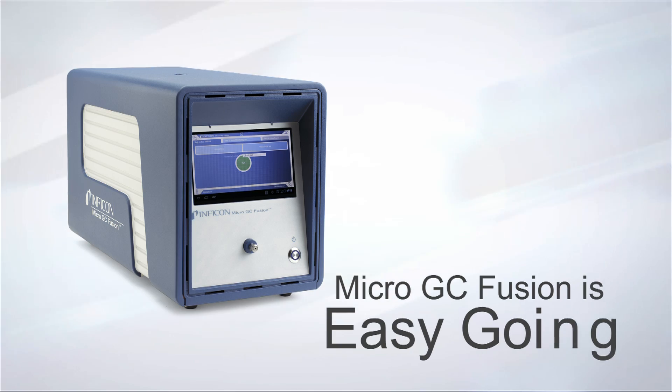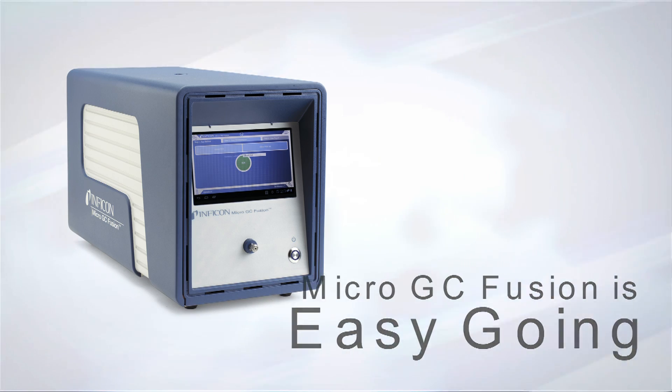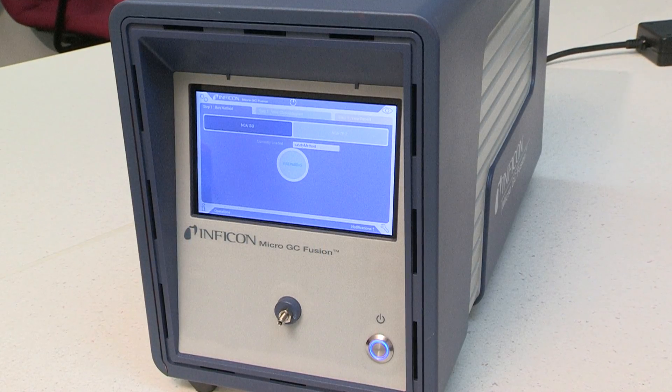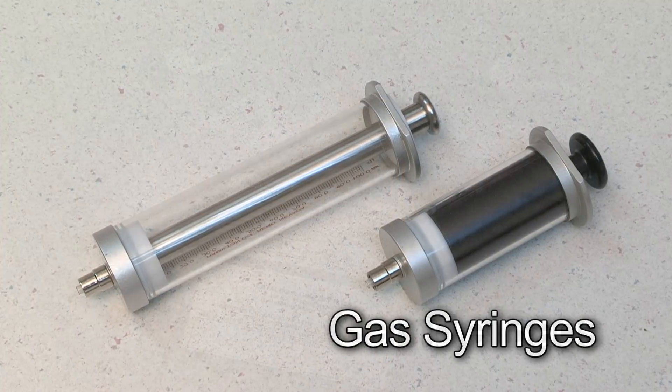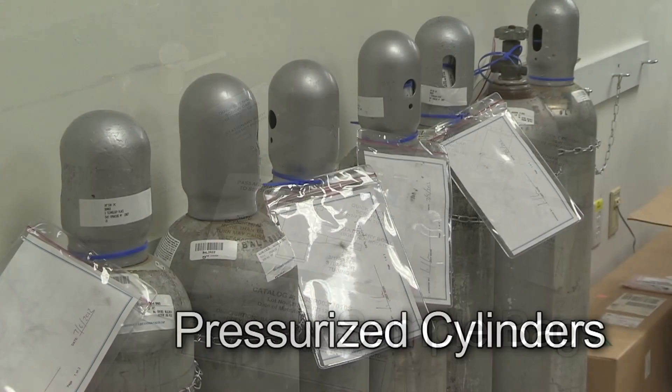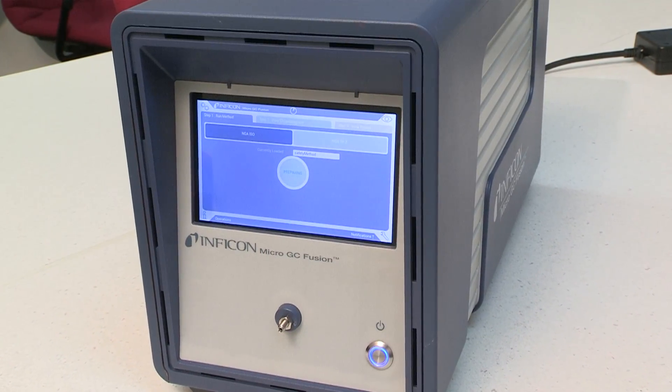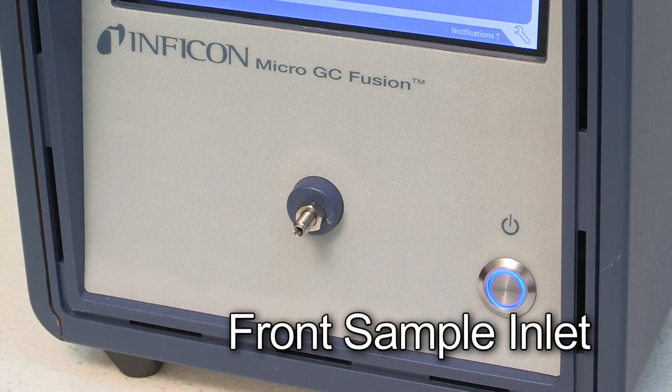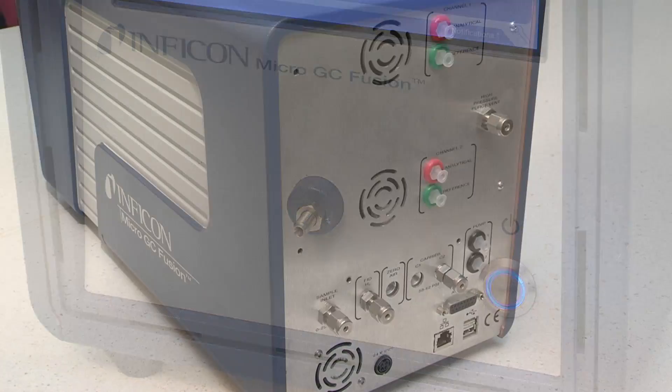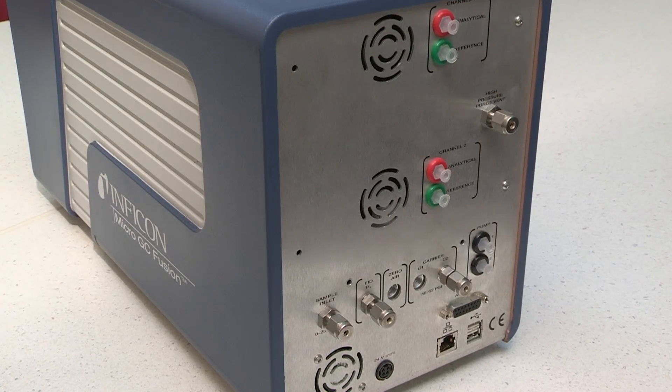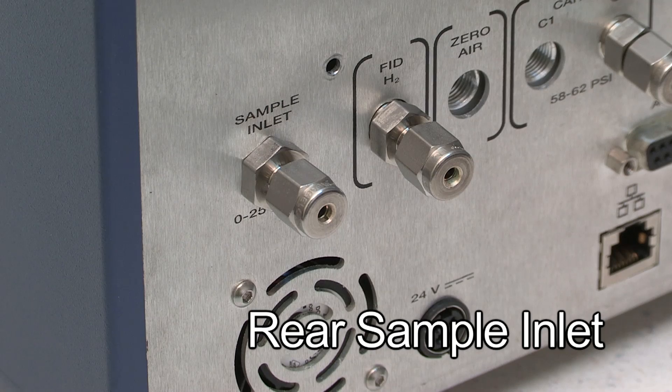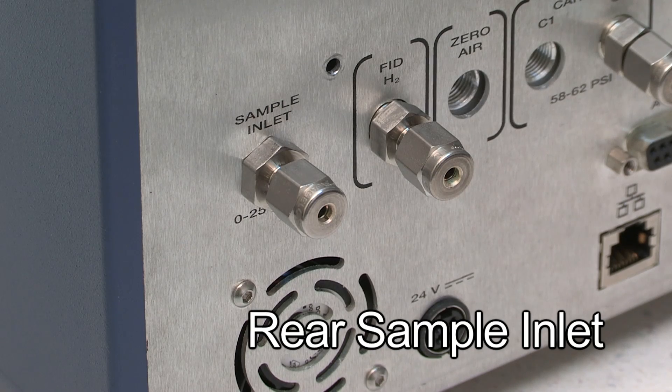Micro GC Fusion is easy going. Samples can be injected using a variety of introduction mechanisms, such as gas syringes, sample bags, pressurized cylinders and pipelines. The front sample inlet is heated and deactivated to assure measurement accuracy and repeatability. A sample gas may also enter the instrument from the rear inlet, providing front and back sample entry flexibility.